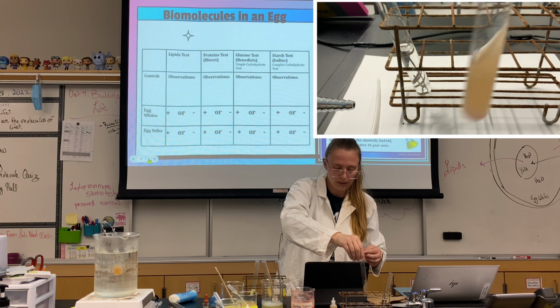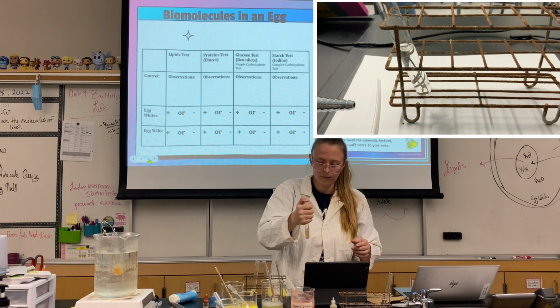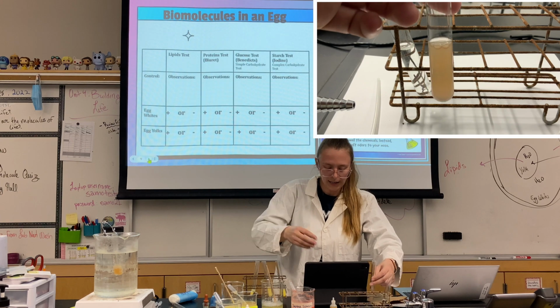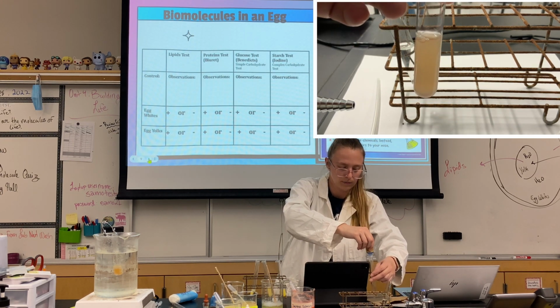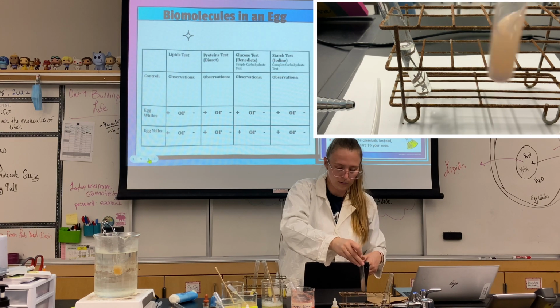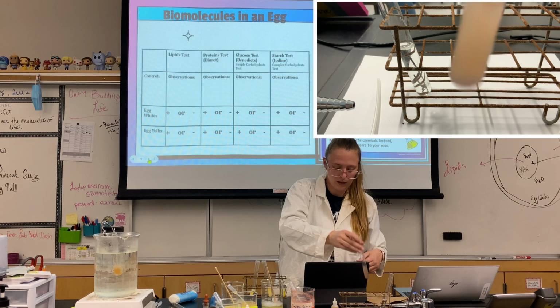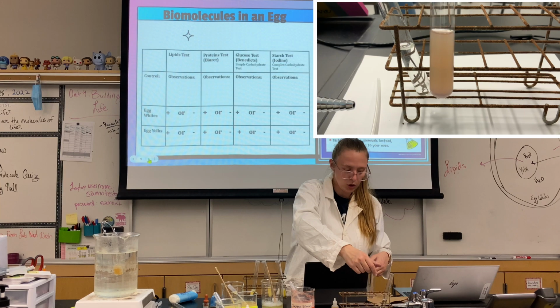Let that mix up a little bit and shake it. As you can see, it changed color a little bit. I think we need a little bit more. Here we go. And swirl it around. So I have a lot of protein solution in there. And as you can see, it changed to a purplish hue.